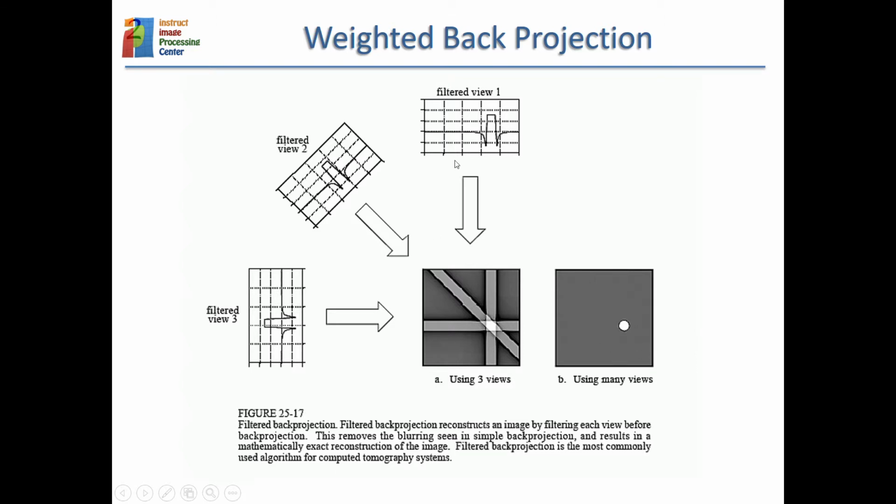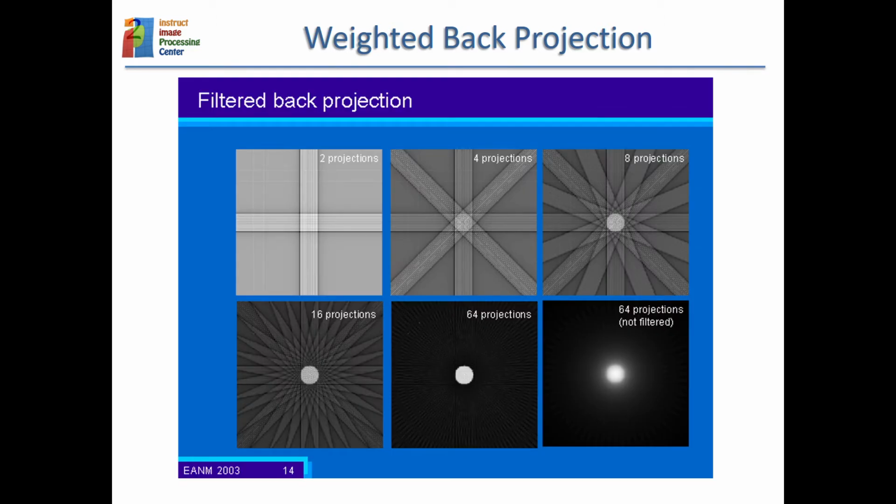But otherwise, if we only have 3 projections, then we see that this object and this other object are both compatible with our measurements, and we cannot say which one of the 2 is more plausible unless we have some a priori knowledge, like, okay, my object is concentrated towards the center, so these stripes coming out shouldn't be present. That would be a priori knowledge that we might have about our object. And here you have the same process.